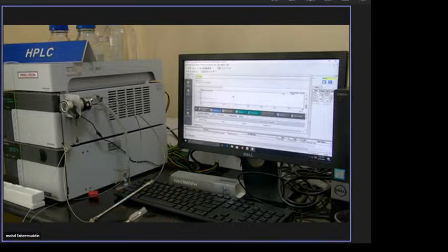These columns are each around 50,000. Depending upon the columns, and even the part you are handling costs 5,000. So you have to handle it very carefully, and after that you have to wash it with distilled water. Otherwise it gets stuck.